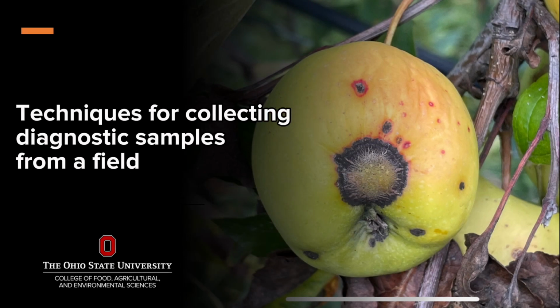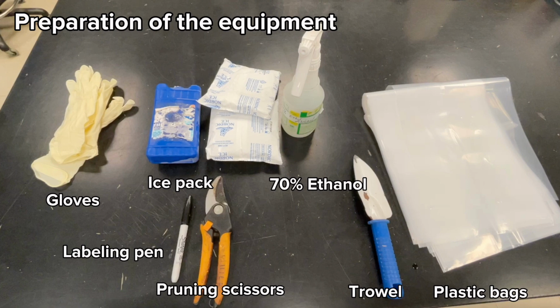This video covers how to collect proper samples from vegetable fields, orchards, vineyards, and ornamental landscapes. Before visiting the field, prepare the equipment.